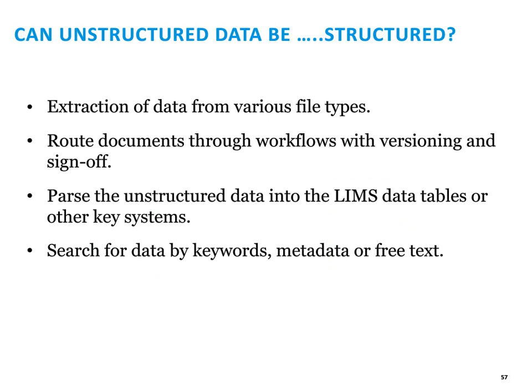Another hot topic in the world of LIMS is scientific document or data management systems, a system that can take unstructured data and structure it for you. You would want to look for a provider who can give you that sort of service built into their product or as an add-on product, so that you don't have to go out and deal with a totally separate vendor if possible. Again, trying to keep everything with one vendor eliminates a lot of problems down the road.